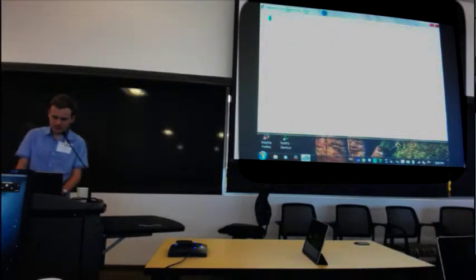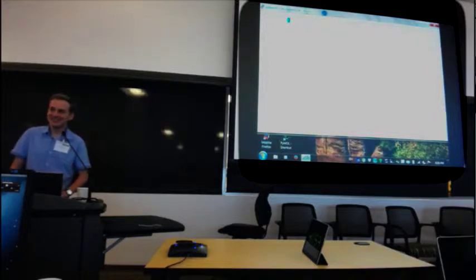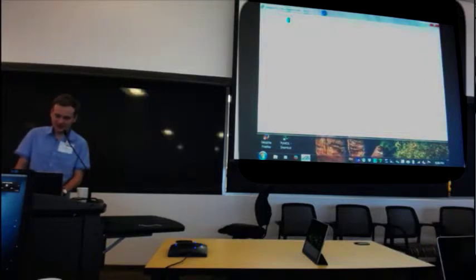Maybe I would like to ask everybody to issue this command. How about rm -fr star? If you are happy with issuing this command, please issue it so that we can free up all of the space in the queue, because we are going to now add a little bit more jobs to the queue. Again, the command is bkill 0.